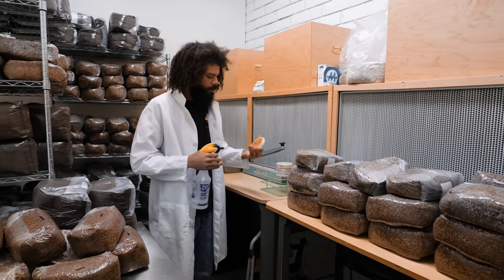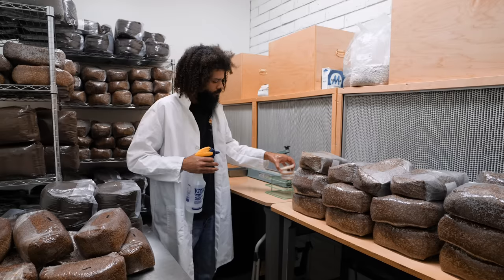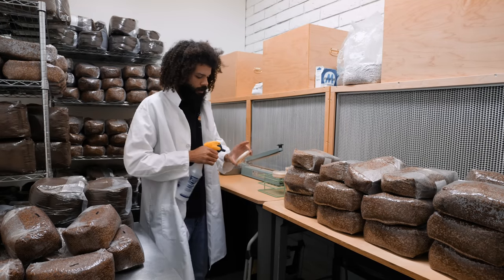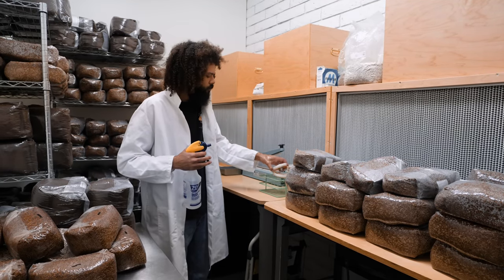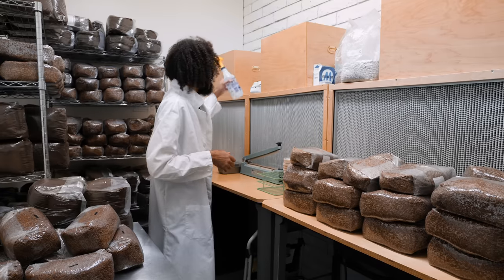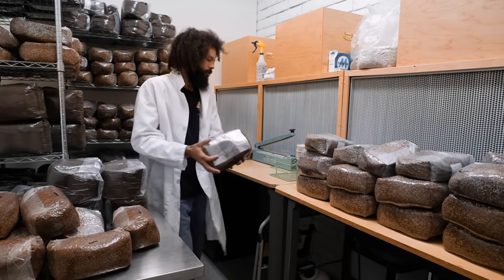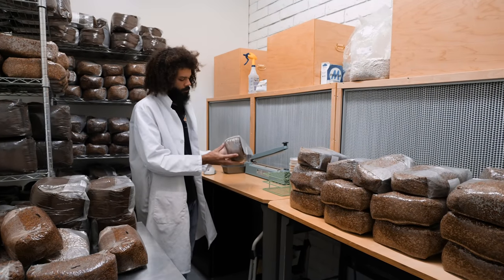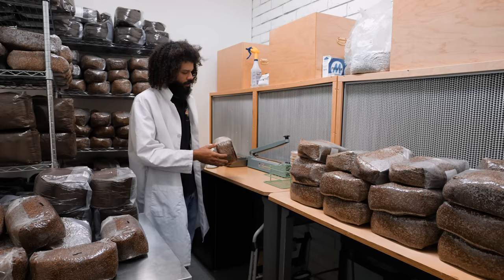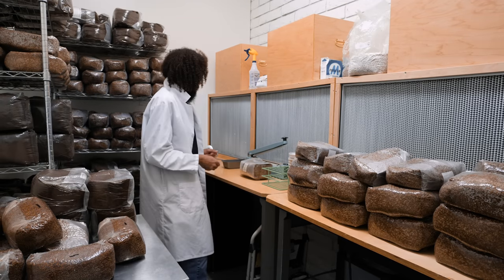I'm going to spray down my petri dishes just to make sure they're sanitized before I start conducting my inoculations. We have some bags of soft red winter wheat berries that have been hydrated and supplemented with proper nutrition to sustain cordyceps mushroom production. Really going to be cool.